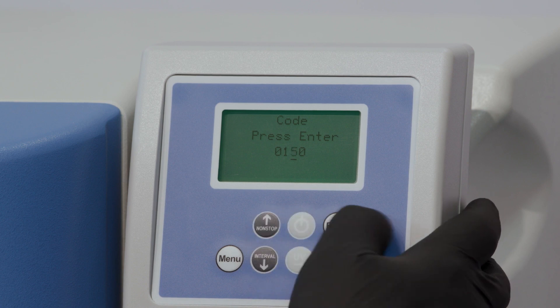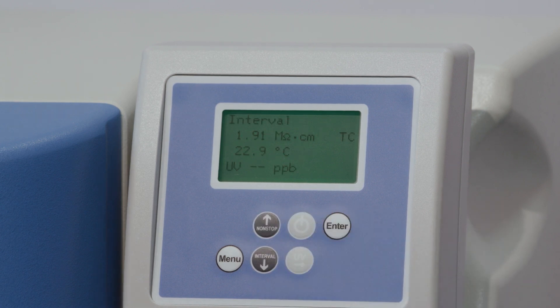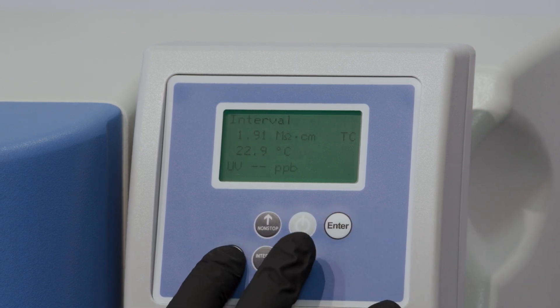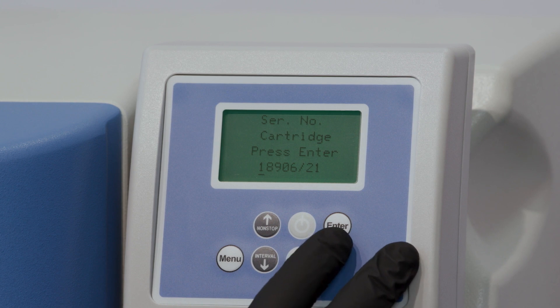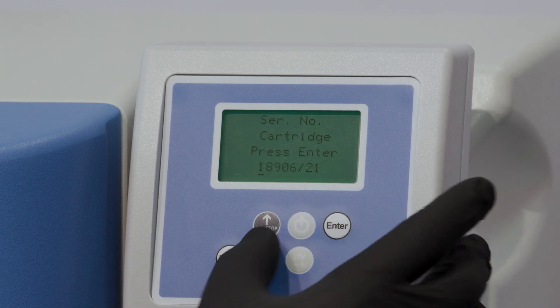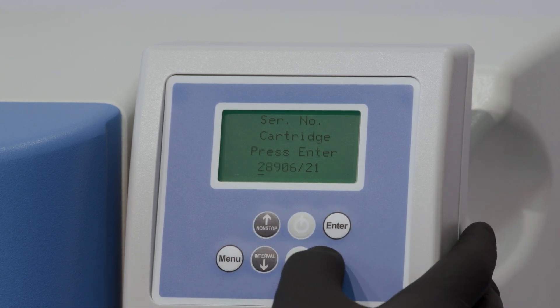The system is now unlocked. Press the menu button again until you reach the serial number cartridge screen, then press the enter button to confirm. Enter the serial number of your new UltraPure cartridge by pushing the non-stop or interval buttons to change the numerical values displayed on the screen.